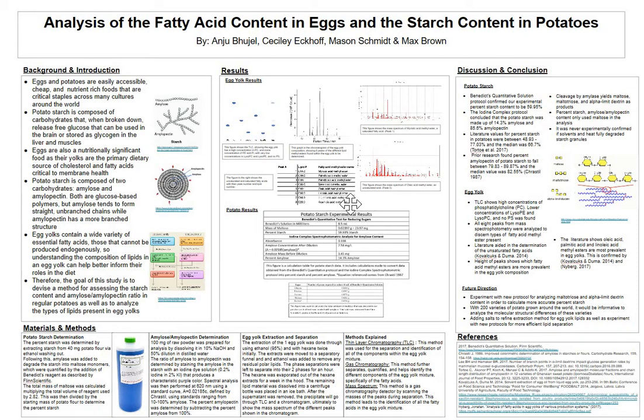And here in this last table, it says the peak number, the fatty acid number, and then the fatty acid name.